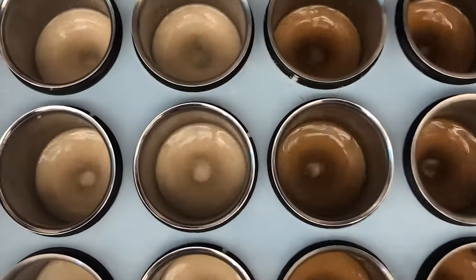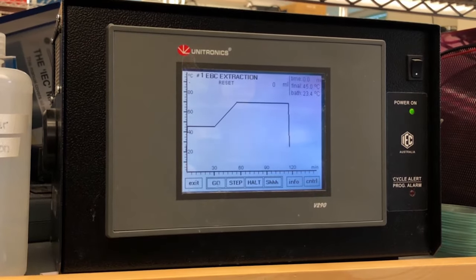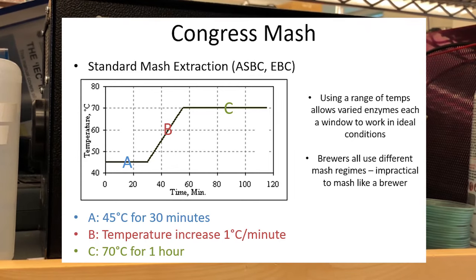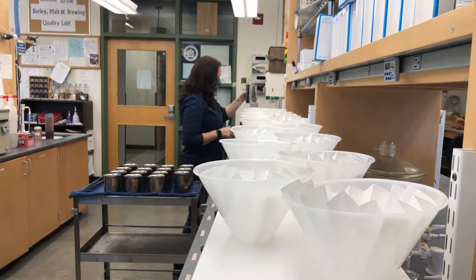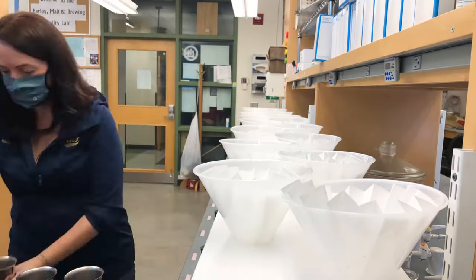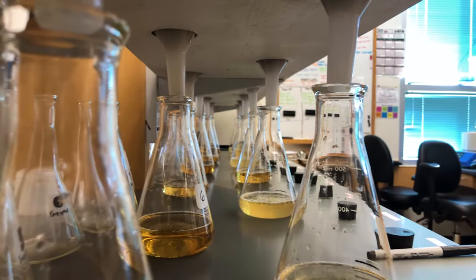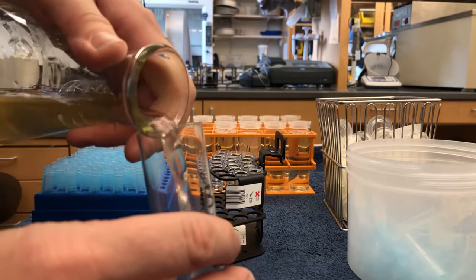Here we are at our mash bath, where we'll do a Congress mash. That basically means we take about two hours and a temperature regime which allows maximum extraction of that sample. There are about five different enzymes responsible for the conversion of starches into sugar during the mashing process, and this Congress regime allows two hours and multiple temperatures to really maximize that mashing process. Once finished, we weigh the samples and add water to bring them to the proper grist-to-water ratio, then bring them to the filter station, where we time the process to gain information about the filtration rate for each sample.